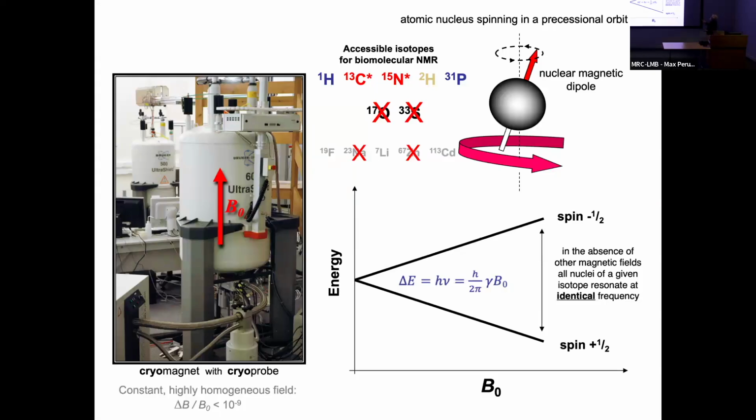So as we have NMR active nuclei in the molecule, they separate out. The energy level between those is directly proportional to the applied field strength. So we have NMR active nuclei for hydrogen. We refer to that as proton as well. I'm so used to referring to it as proton NMR. A hydrogen nucleus, H1, has no neutrons in it. It's just a proton, right? So we refer to it interchangeably as hydrogen NMR or proton NMR, okay?